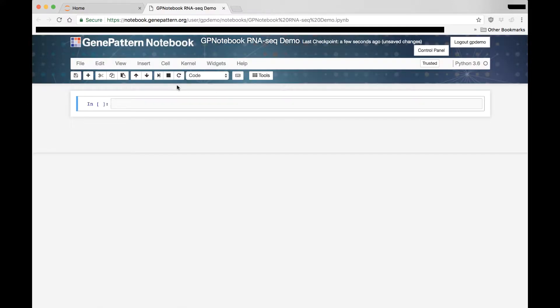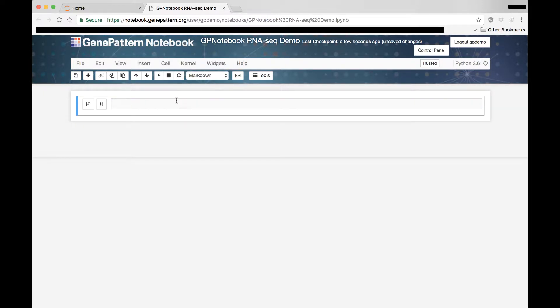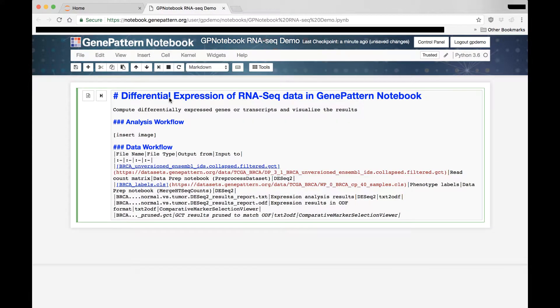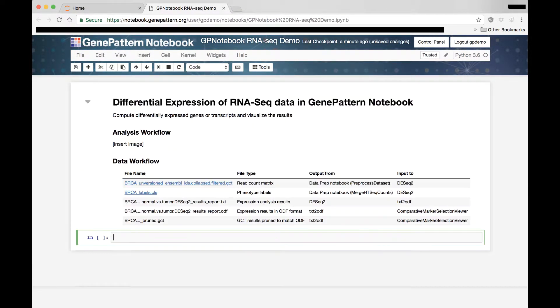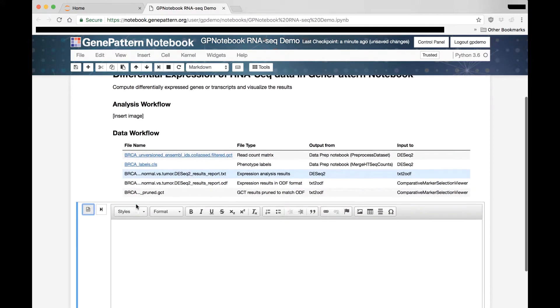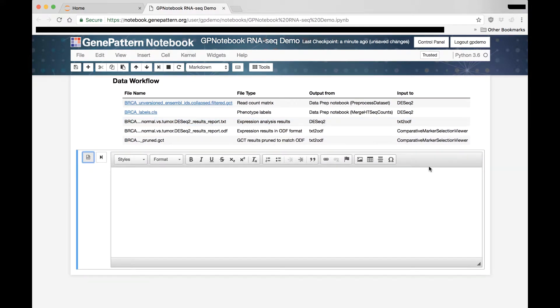Then we'll change the first cell's type to Markdown. If you are familiar with Markdown, you can use the default Jupyter Markdown editor to add in titles, descriptions, or tables. If you are not, or would like to access our additional features, switch to the Rich Text editor, which functions similarly to common word processors.